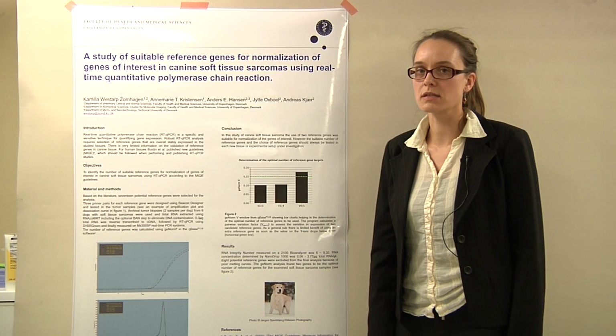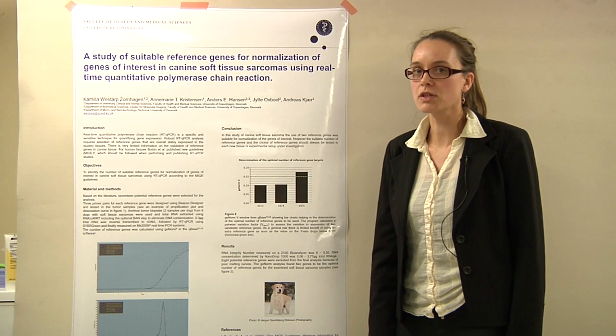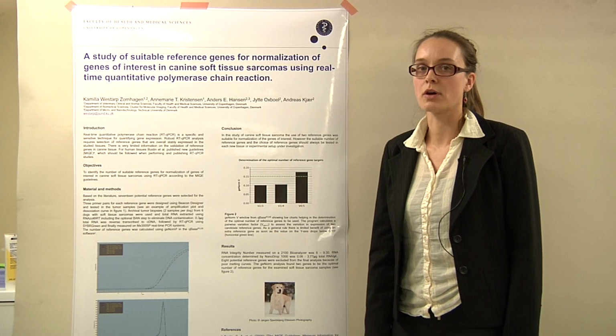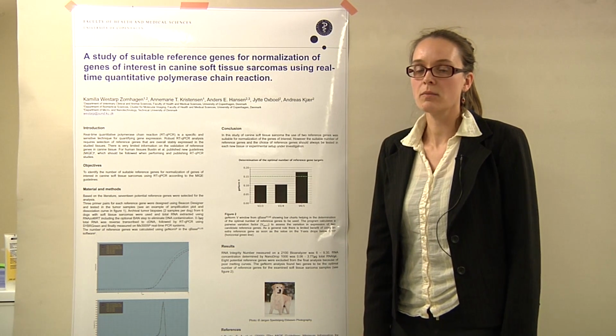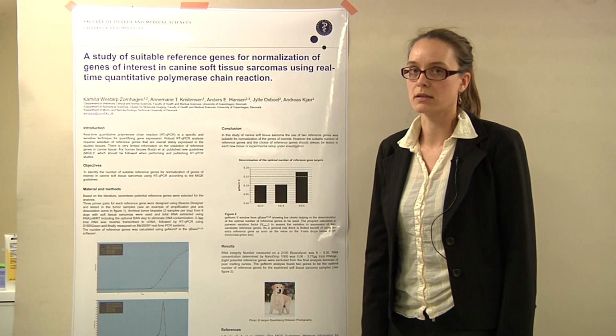RT-qPCR is a very sensitive and specific method for measuring gene expression. When using RT-qPCR, it is important to normalize your data to some overall stably expressed reference genes. Often more than one reference gene is necessary for normalization.